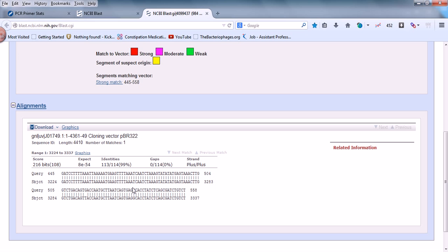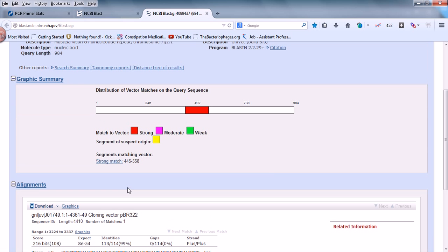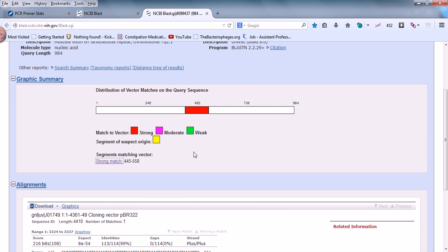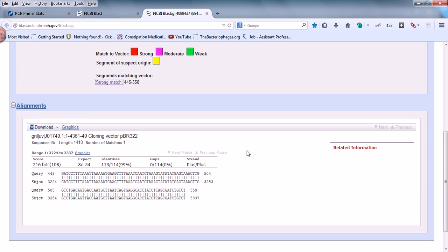The pairwise alignment shows exactly where the identical region is. The color coding tells us whether identity is weak, moderate, or strong — strong means very high identity. If you click on 'strong match,' it redirects to a page explaining that a strong match means the probability of a random match is one in one hundred thousand queries, confirming it's a very good match.